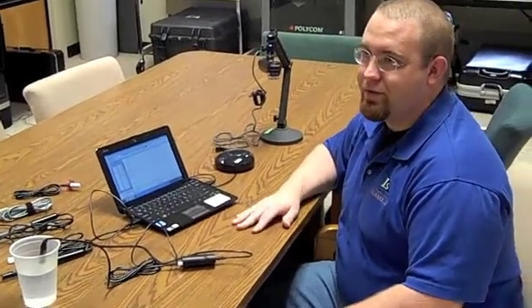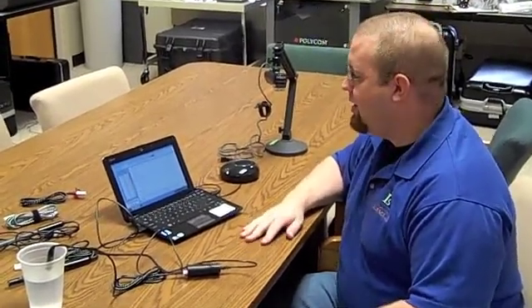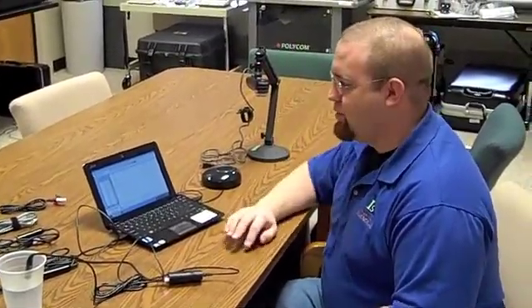So, the probes are different costs depending on how complicated they are. The temperature probe starts out at like $20 and they go up. The microscope is roughly $250. And the software that it plugs into, the Logger Pro software, is about $189.